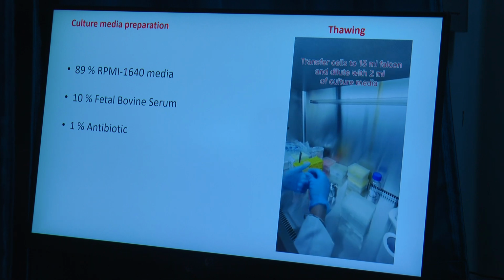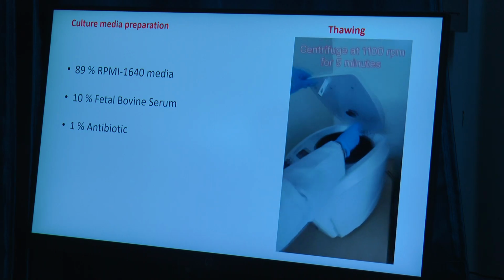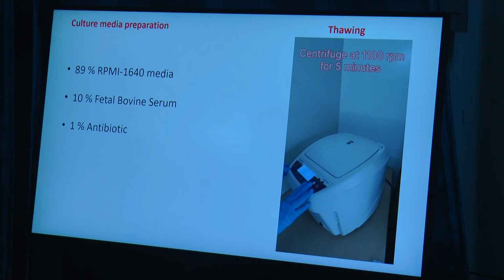Okay, so now after this, Harshmi, what do you mean by thawing them very fast? Fast means they're in freeze condition, no? So to thaw them to the normal temperature, to bring them to the liquid stage. Fast means I have to bring them from the frozen to the liquid state very fast. How do you do that?